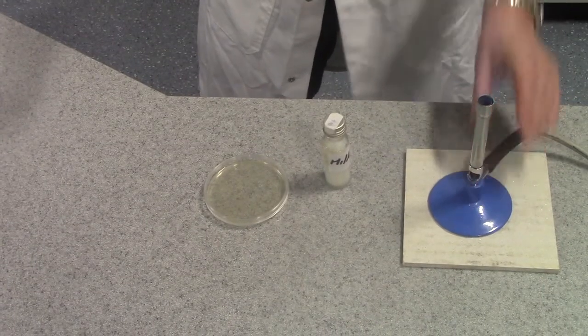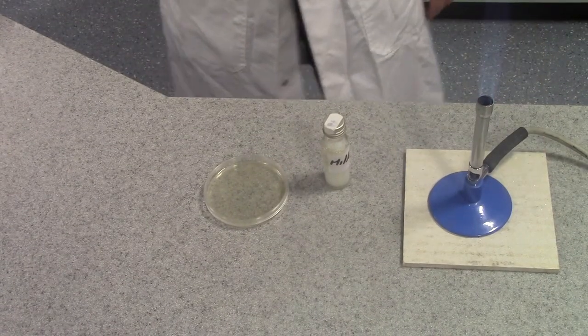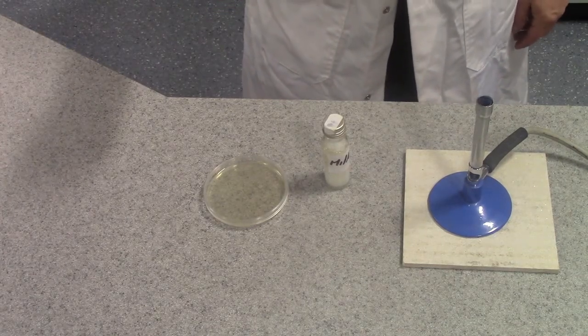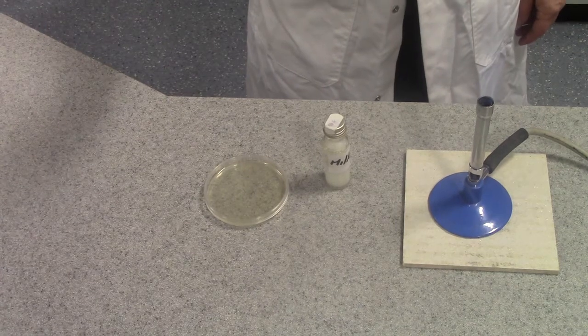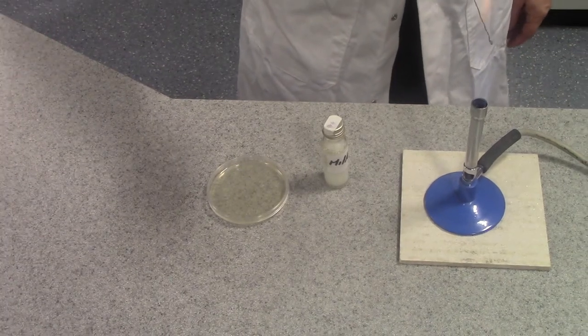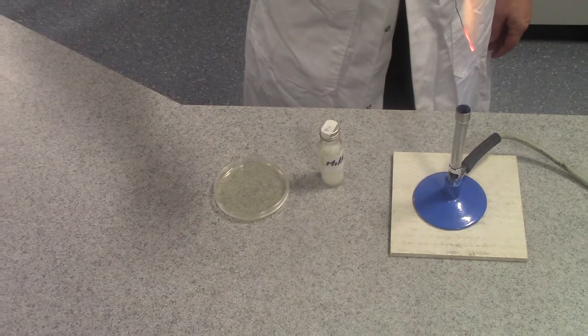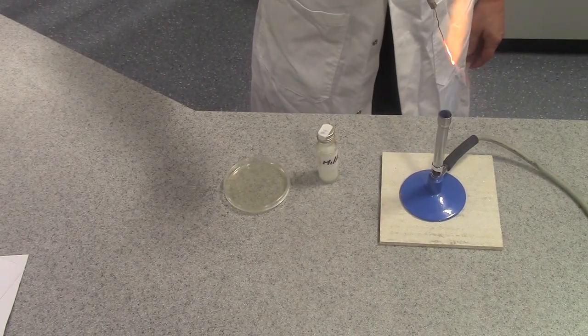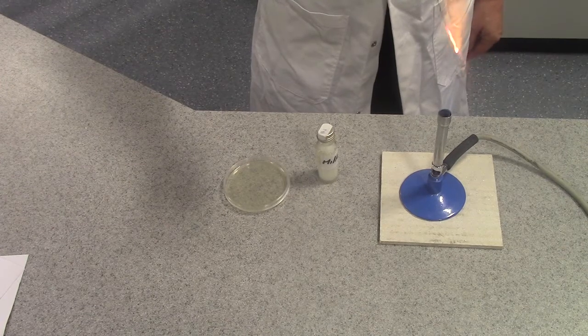First of all, turn the Bunsen burner to the hot flame, and then it's important to use aseptic technique throughout this procedure, so we're going to flame the loop until it becomes red hot. The purpose of this is to kill any bacteria or other microorganisms that are on the wire loop.